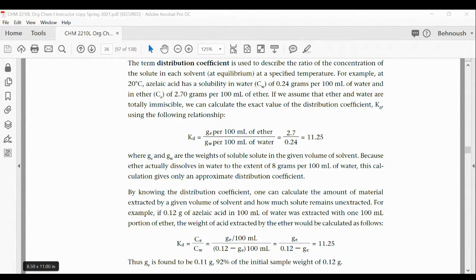Different acidity, no, that different acidity is the other compound. When it comes to choosing of the solvent, it doesn't have to be acidic or basic. We're not talking about the reagent, we're talking about organic solvent. It doesn't react with the solute, so it should not chemically react. It should be easy to separate. You don't want it to react because it has to be easily separated later.